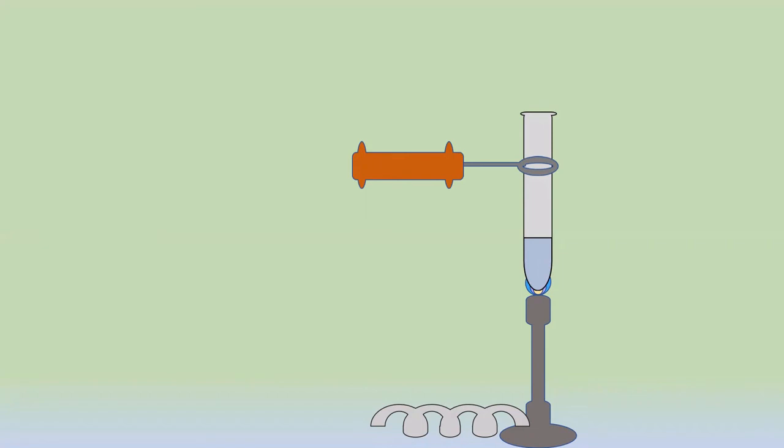Now in this case we are using water as a solvent, right? And therefore I'm going to do direct heating of this test tube on the wire gauze, sorry, directly on the burner. Okay, so test tube holder से उसको पकड़ना है और directly heat करना शुरू करना है. Now you can see the solid which was there, now it is completely dissolved. Okay, so completely dissolved solid, it is indicating now the compound is soluble on heating.